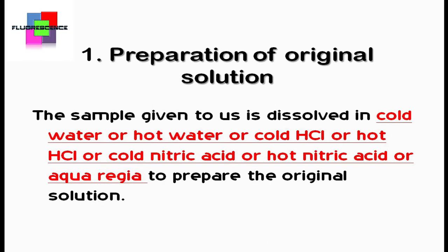Please note, the words cold and hot are very important. They are the keywords and they should be written. But the word cold doesn't mean it's going to be an ice cold solution. It actually means the water or the acids at room temperature.